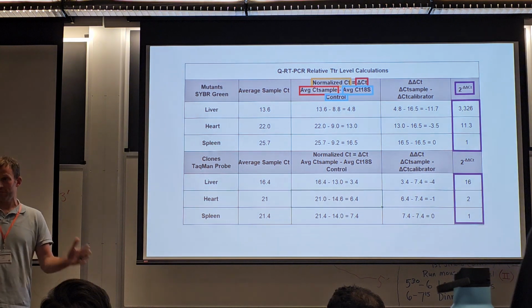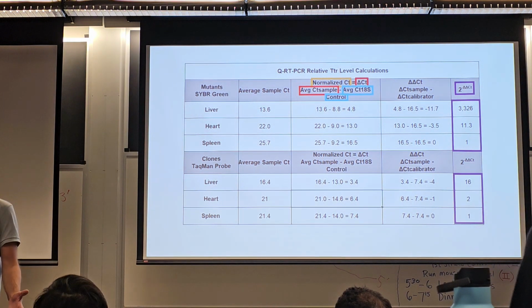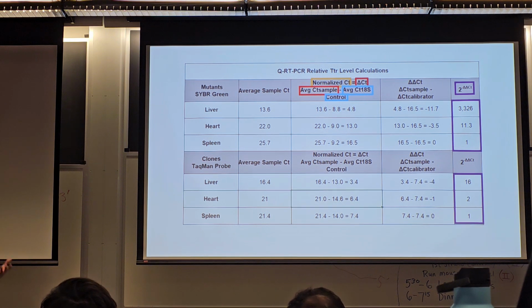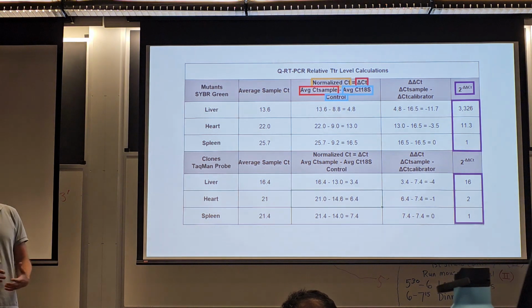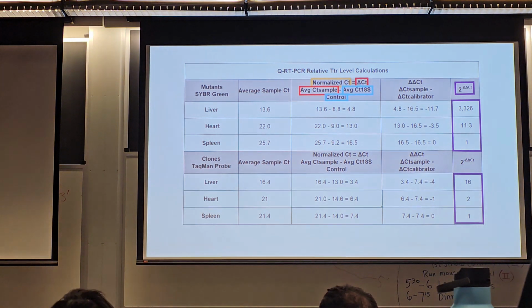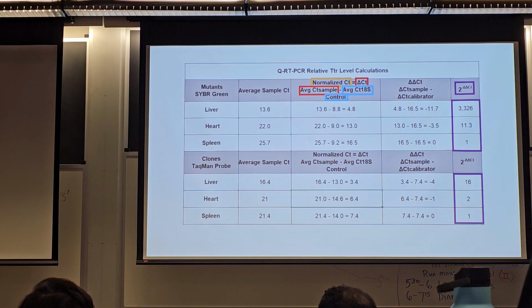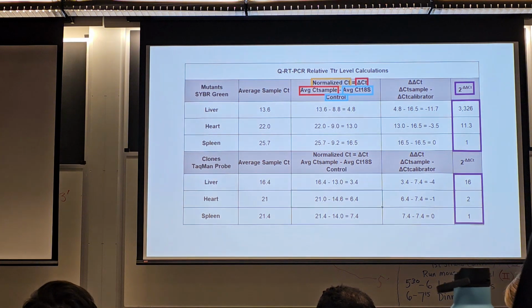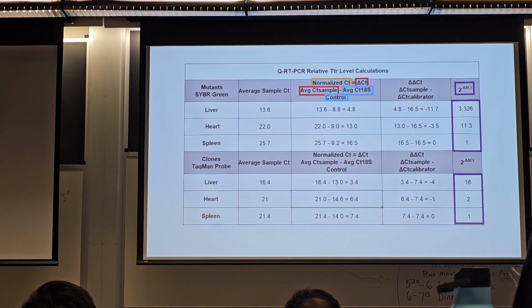Right, so it's pretty straightforward, the way we generally analyze this. This is something that, when RNA sequencing was first a thing, you would always have to do to validate your RNA-seq fold change results. That's become less and less common. Generally now, RNA-seq data is trusted at face value without having to do a lot of real-time validation of your RNA-seq results.